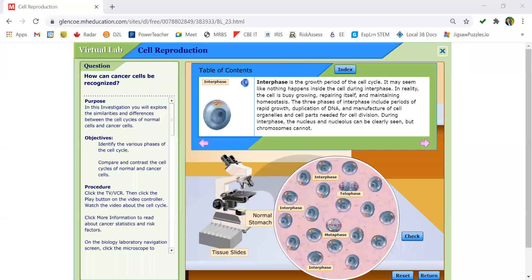Now let's look at normal stomach tissue. We can see most of the cells here are again in interphase because only the chromatin is visible. We have one in metaphase because we can see the chromosomes are aligned in the middle of the cell. We also have one cell here in telophase because the chromosomes are moving to the opposite side of the cell.